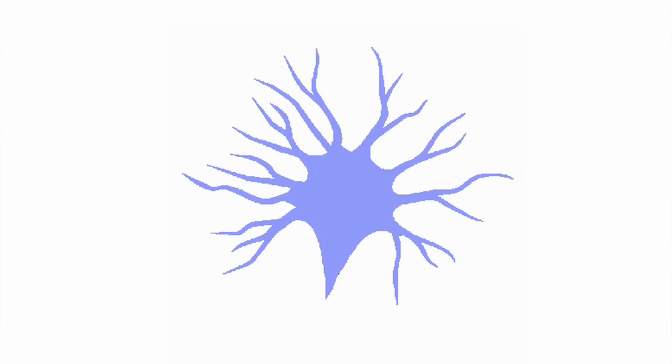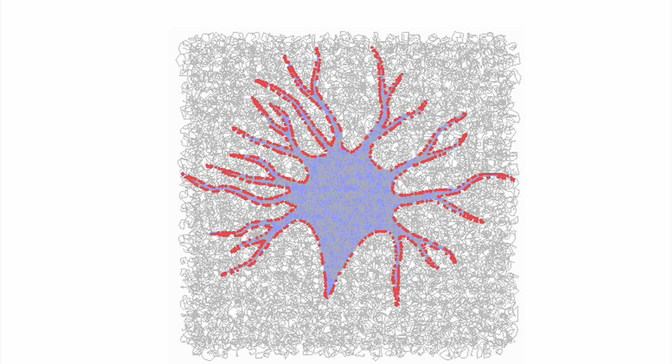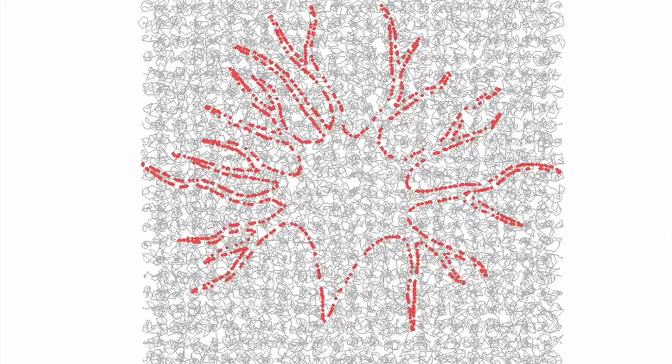Expansion microscopy is not a new microscope. It's a series of steps which we apply to the sample to physically magnify it. First, you label the structure you want to see with a fluorescent dye that will be anchored into the network. Second, you deliver the precursor and then you form the chemical network right there inside the specimen. Next, you have to chop up all the endogenous structure in the tissue so that it will not resist expansion. And then finally, you put it into pure salt-free water and it spontaneously expands.